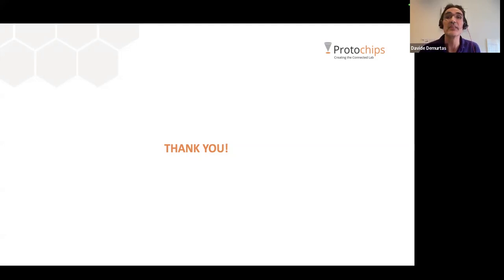Hi. Yes, please. Can you hear me? Yes. Hi, okay, yes. So really nice presentation. And my field of research is actually biomineralization. So I was very interested in that paper you showed from Science Advances about biomineralization. But since then, a lot of good studies have come out with aggregation of hydroxyapatite and calcium phosphate. But I'm wondering, where are we in terms of introducing a biological component like a protein, collagen protein, in actual biological simulation fluid? Where are we in terms of that?